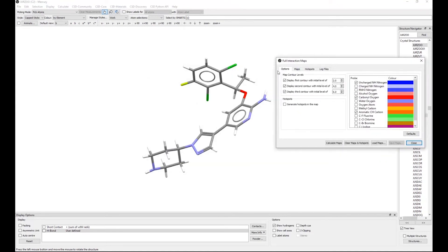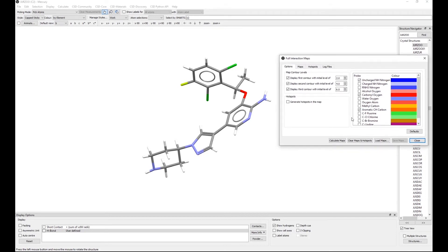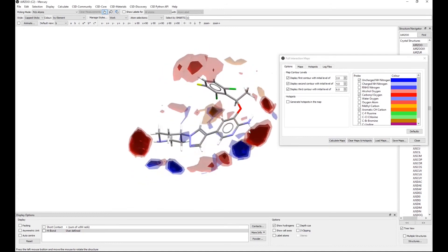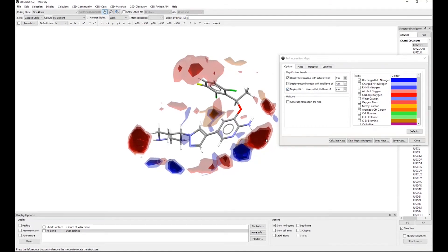By default, three probes are selected: the uncharged NH nitrogen, the carbonyl oxygen, and the aromatic CH carbon — representing a generic hydrogen bond donor, a generic hydrogen bond acceptor, and a generic hydrophobic group. We recommend starting with these for a first pass, though there is quite a diversity of other functional groups available. I click Calculate Maps and give it a minute to run. The maps are then generated with different contour levels: a contour level of six means interactions are at least six times more likely than random.